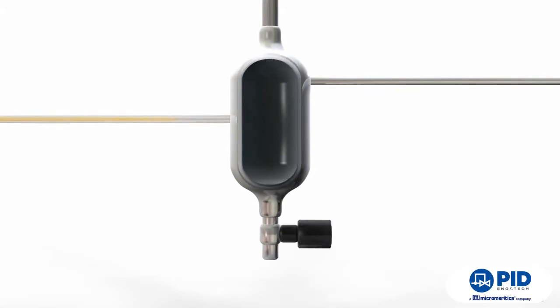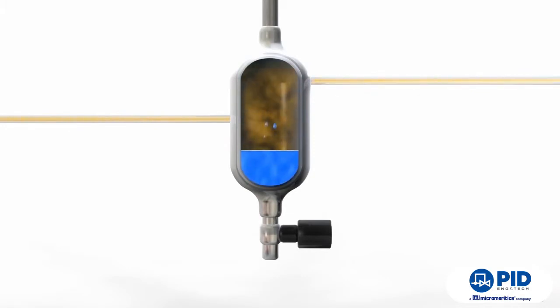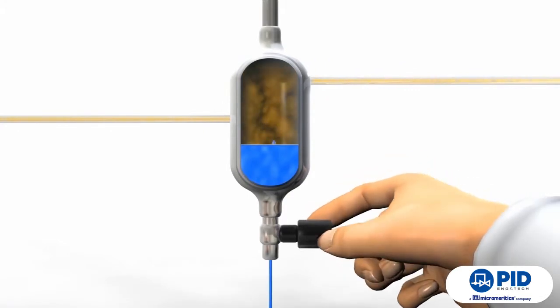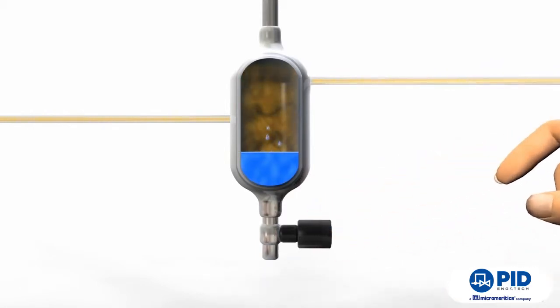In an atmospheric pressure reactor, the removal of condensed liquids in the separator is performed manually by an operator, but with this procedure, the products obtained through time might mix, leading to inaccurate results, as the data of composition versus time would not be reliable.